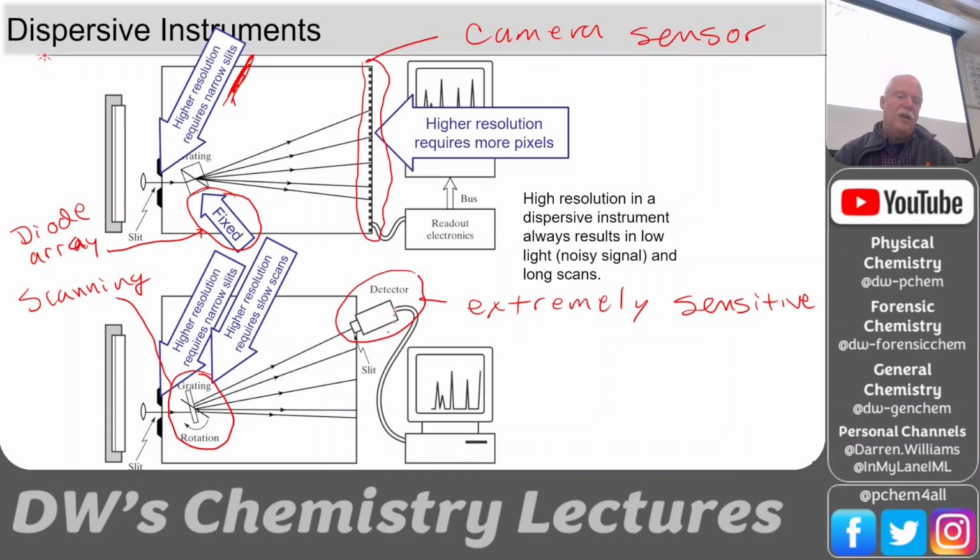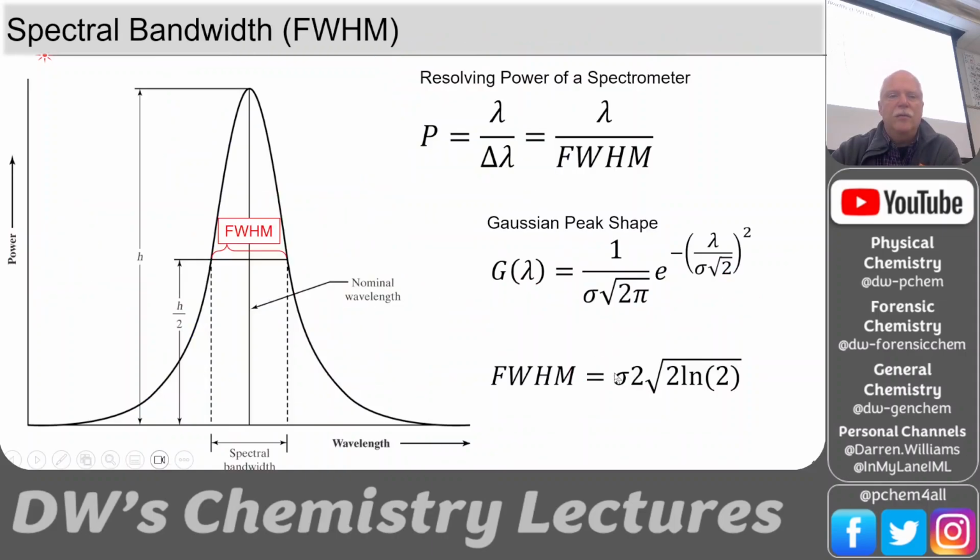So slow scans are a problem for scanning instruments if we want high resolution. Also you have moving parts, and so it's not a very robust thing. You have a motor that turns the grating or the prism really, really slowly, and that motor requires power and so on, so these things are less robust too for field work.